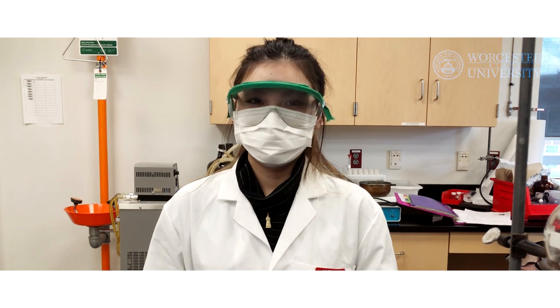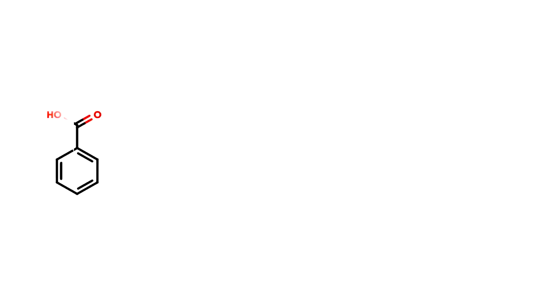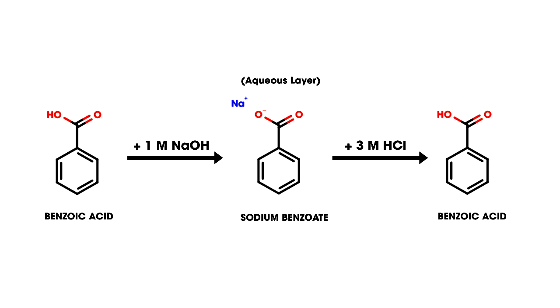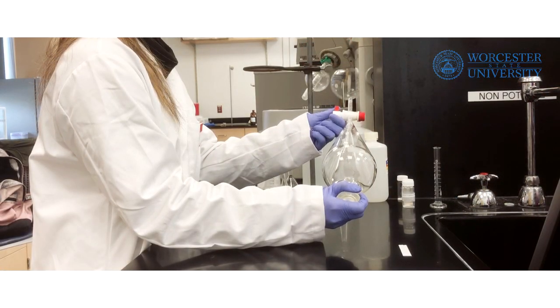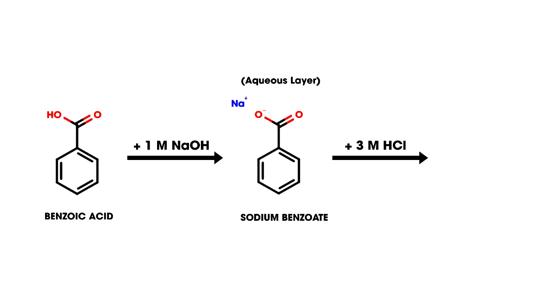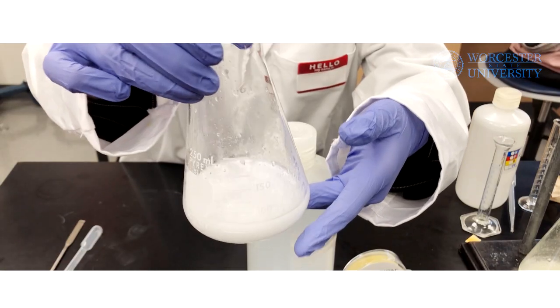For the second part of this experiment, we need to extract the benzoic acid from the ethyl acetate solution that is still in the separatory funnel. This will be done by reacting benzoic acid with 1 molar sodium hydroxide, allowing it to be extracted in the aqueous layer as a salt. Then, we will return the salt to its original form using 3 molar hydrochloric acid. This extraction uses the same process as the previous one. You will add a 10 milliliter portion of 1 molar sodium hydroxide to the separatory funnel, then use 3 molar hydrochloric acid until the solution becomes just acidic, followed by an additional 5 milliliters of 3 molar hydrochloric acid. You will be able to see the precipitate form.